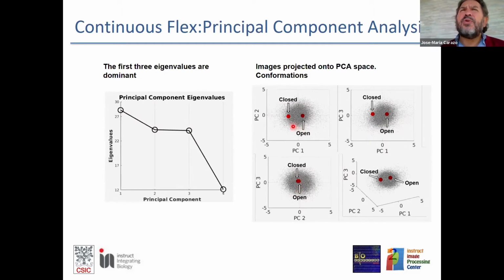Furthermore, when we project on these principal component axes the closed and open forms that we obtained through classification, we see that they span axis 1 very nicely, but they do not say anything about axis 2 or certainly axis 3. So by classification, we are picking up the most, but we are not able to tell about more subtle issues related to the other factors.